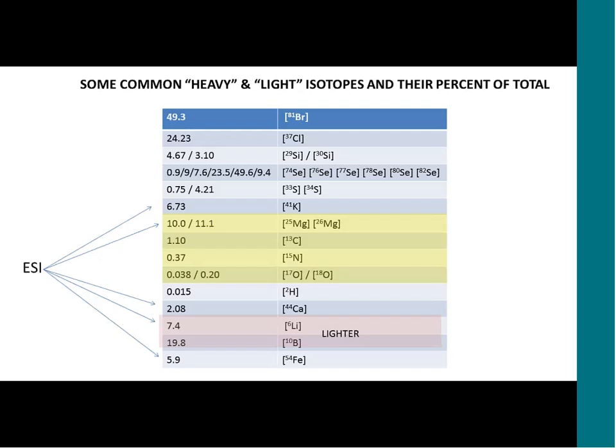And so it goes. But the more difficult cases lie in the yellow band on the slide. So we're talking about carbon-13, nitrogen-15, O17, and O18. You can see that the relative abundances of those are starting to get pretty low. So it's challenging to get the data that you need to get a proper evaluation of the isotope profile. Now, of course, many of you are probably using electrospray.